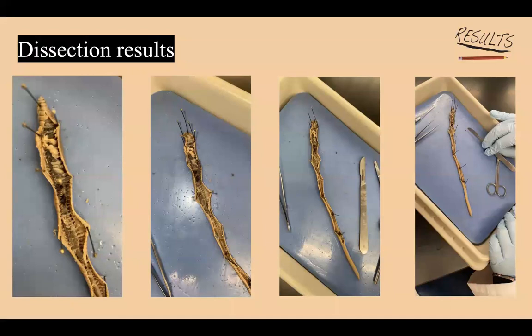And then as you see on the slides, those are the pictures of our dissection results of our earthworm that me and my partner dissected in class, and they're just different angles of what we were able to see when we opened it.